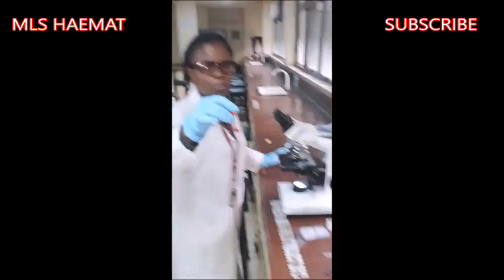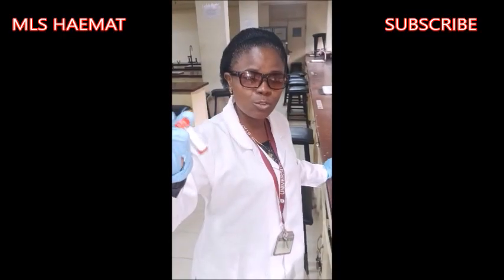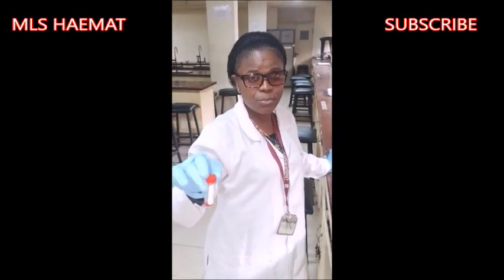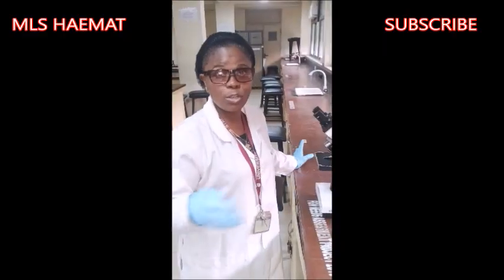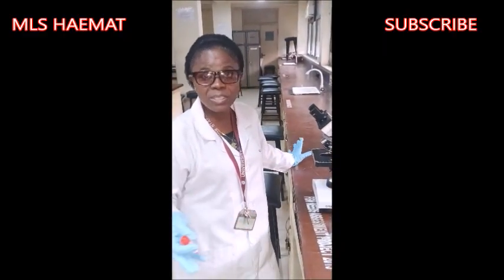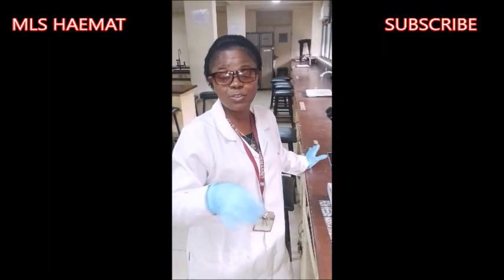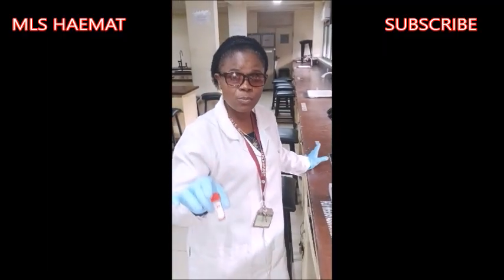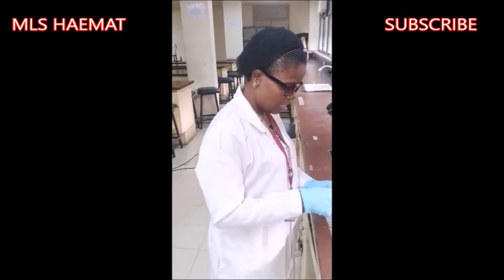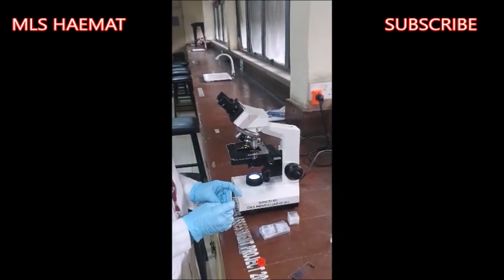Then I also have a blood sample here. If I want to view this blood sample under the microscope, maybe I want to check for the presence of microfilaria, for example, or probably in the blood bank I do a cross-matching or a Coombs test, and I want to view the red blood cells to look for the presence of agglutination. It's also important for me to know how to view it. So I'm going to start this morning by viewing this red blood cell under the microscope.